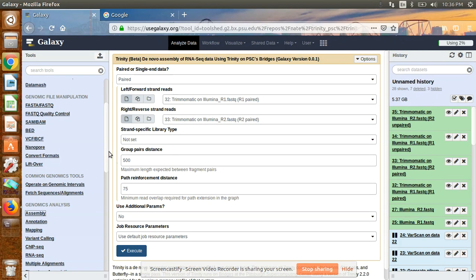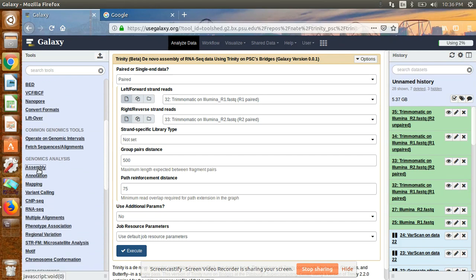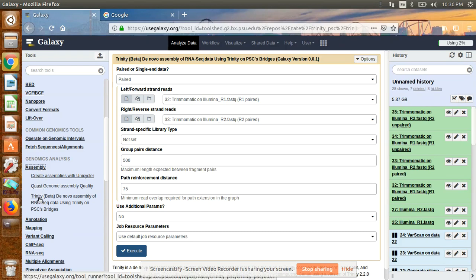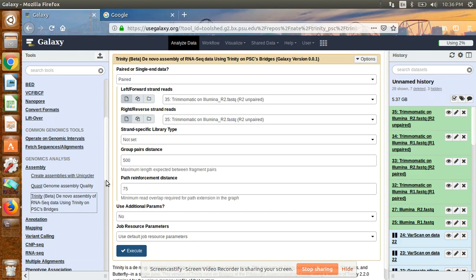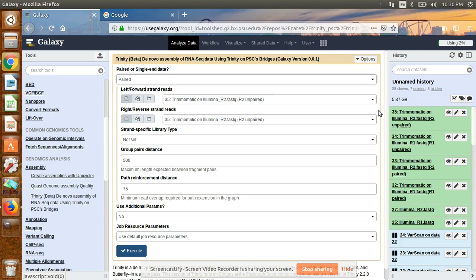On the left side, go to the Assembly option and click on it. You can see the Trinity option — click on it. It will give you options. Since your sequence is paired-end, you have to select paired sequence. After that, you have to select your forward (left) sequence, which is also known as R1, and your reverse sequence, which is R2.